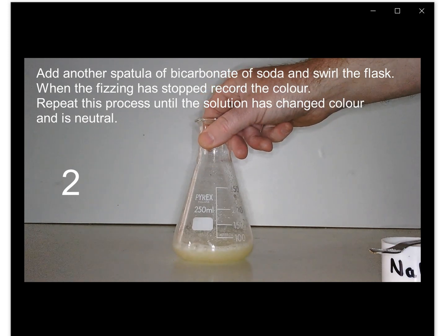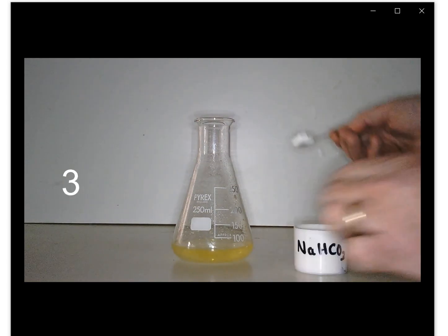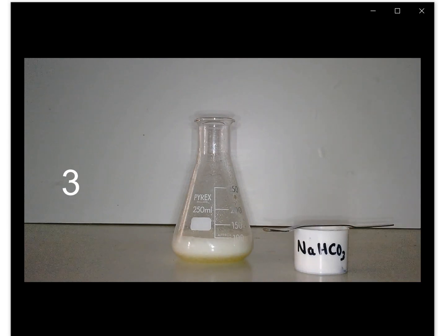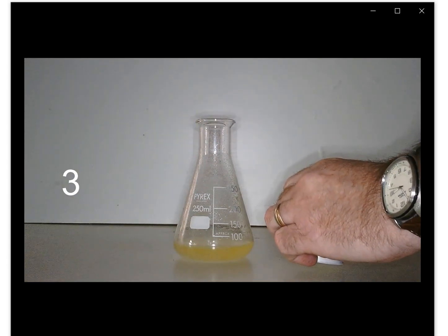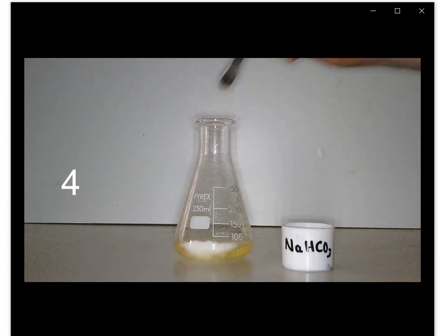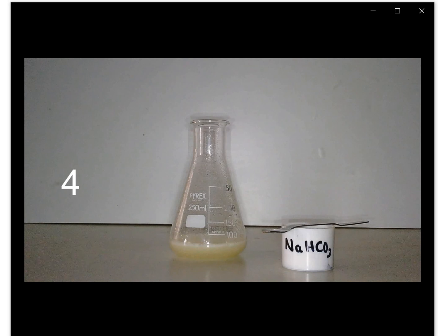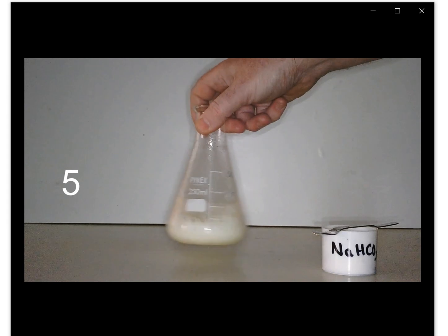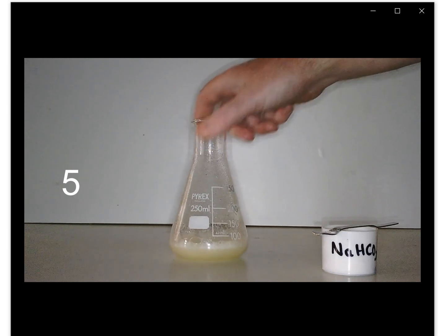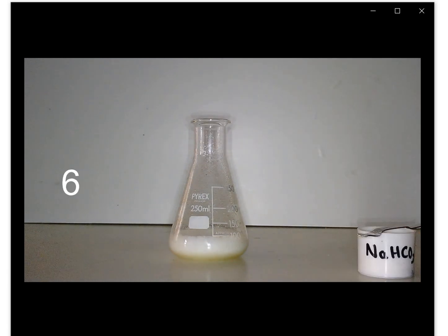Good swirl, make sure it's all mixing, and the fizzing dies down. But we're still on yellow, so we need another spatula. Same again. So don't record this one, number 3 or number 4, because you've not got space in your table. And it's just the same thing happening. 5, don't record this one either. Now number 6, you can start recording this again in your table. So we're getting closer to neutral.